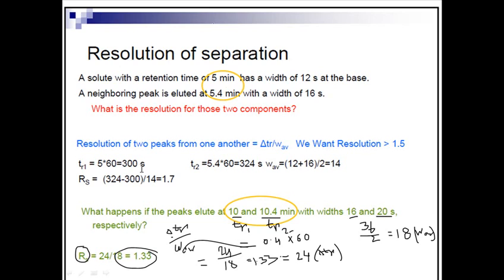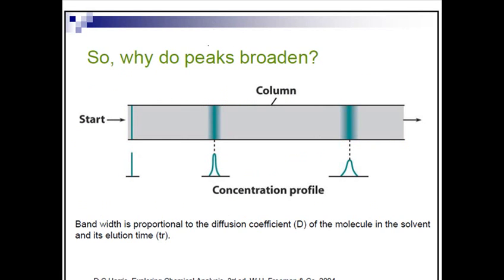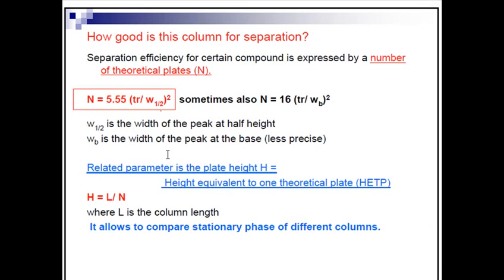Okay, so the resolution means a better separation of different portions or different molecules of an analyte mixture. An analyte mixture is made up of different types of molecules. The more we can separate different types of molecules, the more resolution we can say there is between them. So just go on through this.